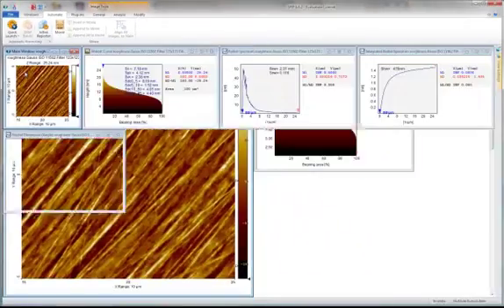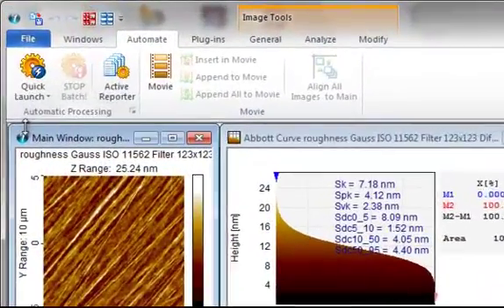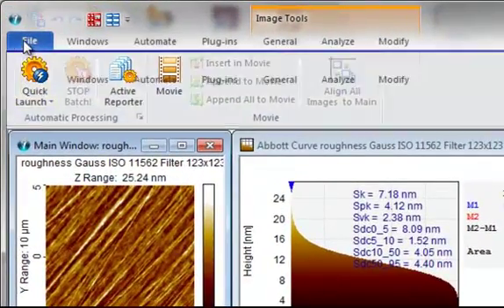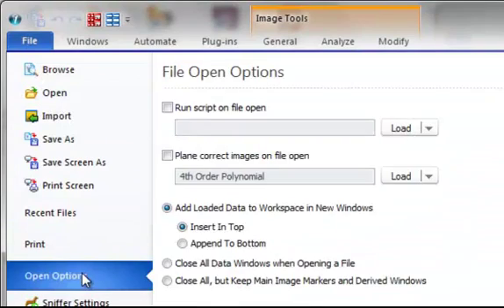If you want to apply this script to all files automatically when they are opened, you can add the script to your open options, which you will find on the file tab.